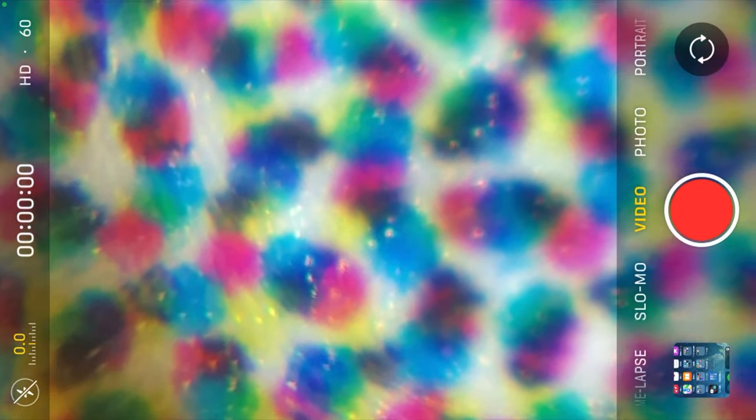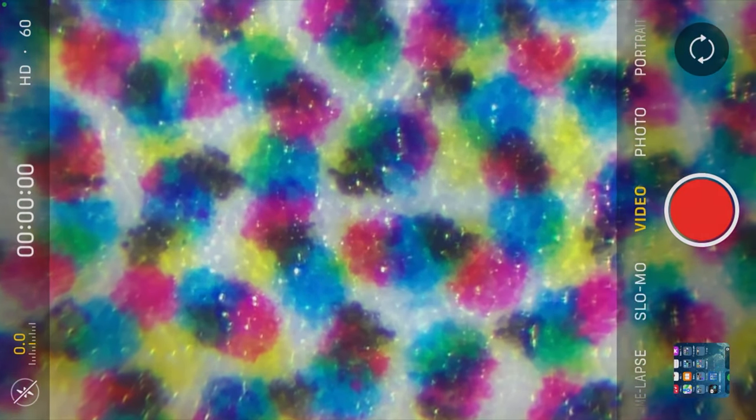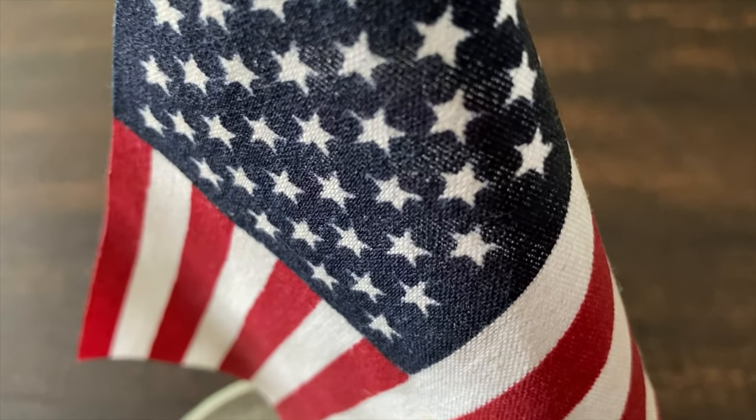Since I have experience with printing, I decided to take a closer look at the microscope's box. That is pretty amazing — what looks like a picture is just a bunch of dots: cyan, magenta, yellow, and black — CMYK. That's certainly a useful lesson that can be shown with this pocket microscope.